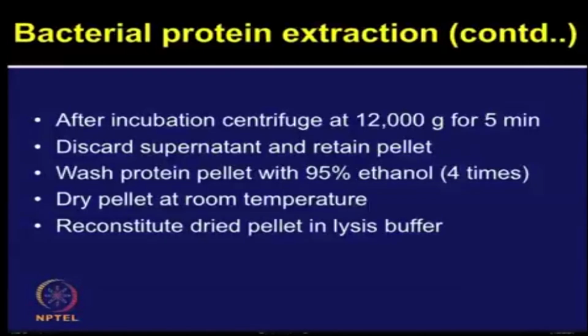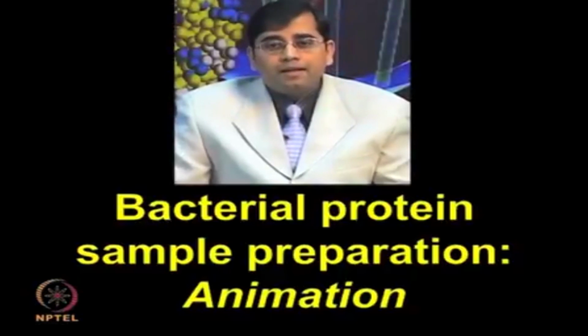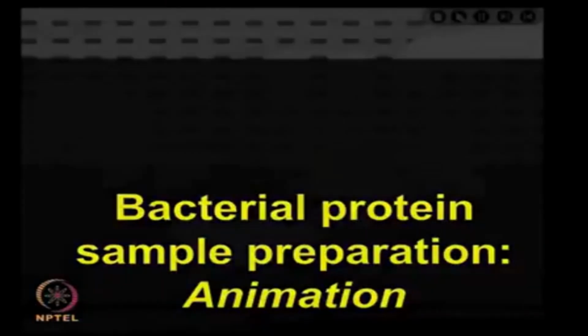Then dry this pellet at room temperature, and this pellet can be reconstituted in a buffer suitable for your analysis. If you are going to perform 2-dimensional electrophoresis, you need to add the lysis buffer which contains urea, CHAPS, thiourea and different other components which we have talked about previously. Or if you want to analyze on SDS-PAGE, you can add the Laemmli buffer. So, depending upon your application, you can reconstitute the pellet in the right buffer composition. Let me show you the bacterial protein sample preparation in an interactive animation.